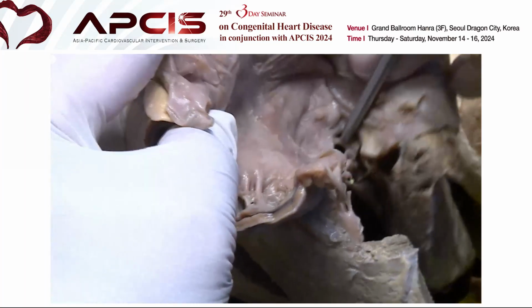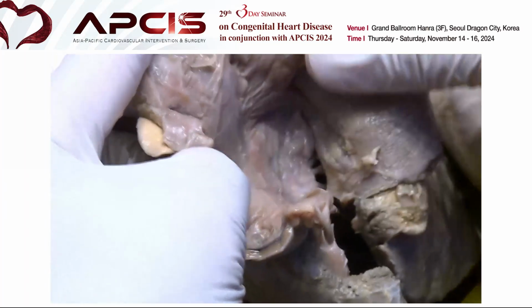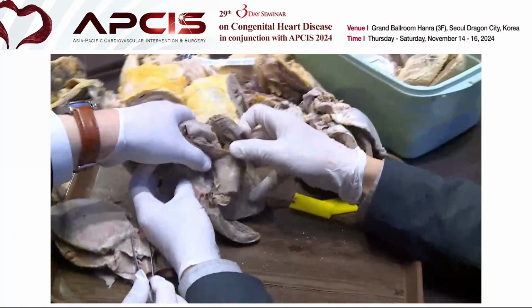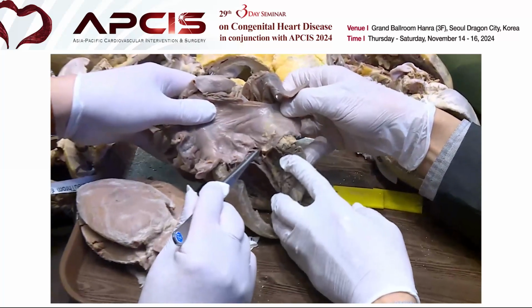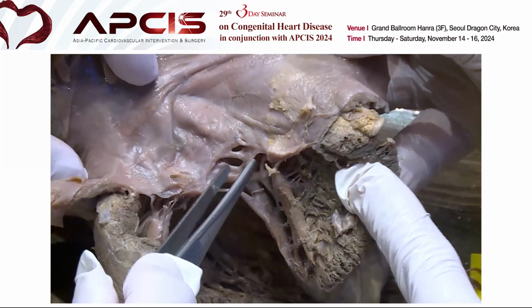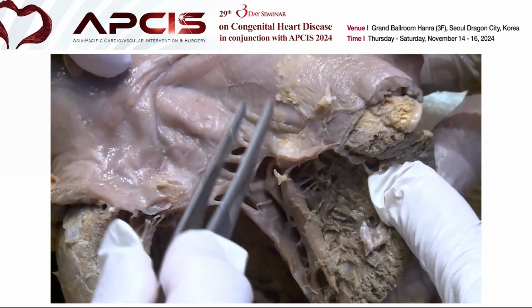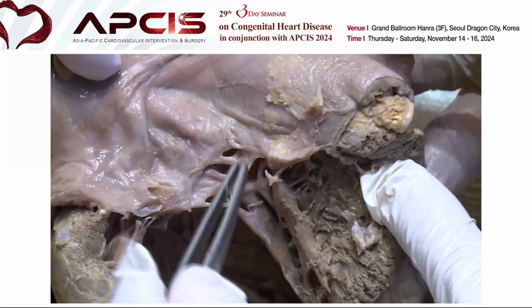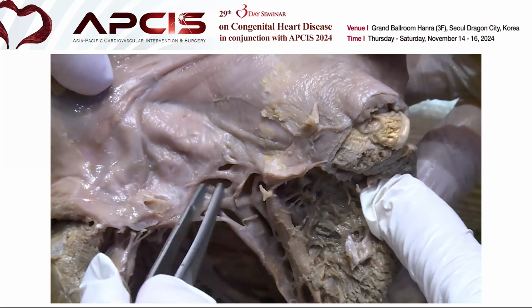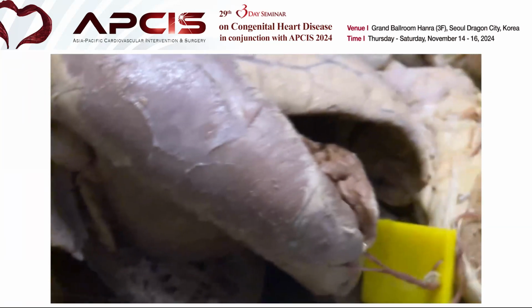And the commissure is severely shortened, and the mitral valve is excised like this, and then a prosthetic valve will be applied to this heart. Some comment? You can see the chordae. The chordae are quite thick, this one, shortened. The typical rheumatic valve disease. So sometimes for pure mitral stenosis, we perform open mitral commissurotomy along the commissure. This is shortened, usually then twice longer than the quite short and thickened chordae. And this is the last case.